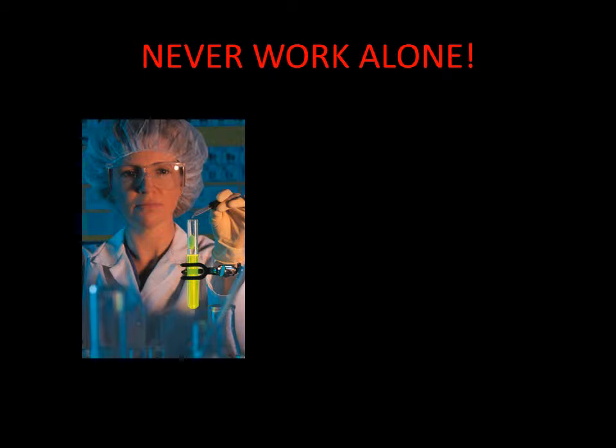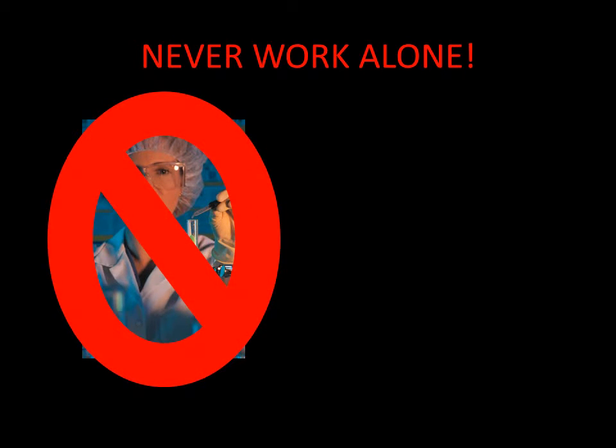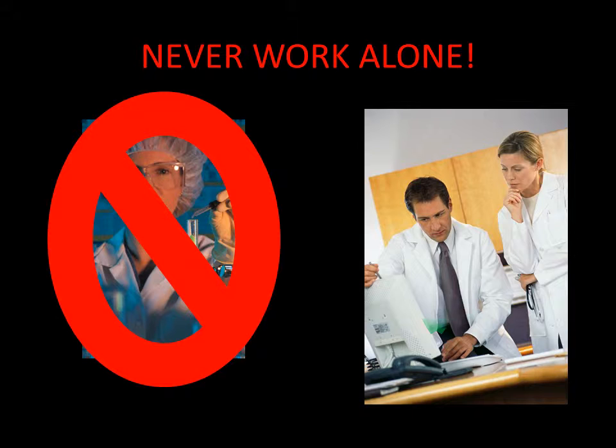Never work on a lab alone. Although the chemicals and utensils we will use in our labs aren't the most dangerous, we would never want you to be alone if you were to become injured. So to solve this problem, always have a lab partner.